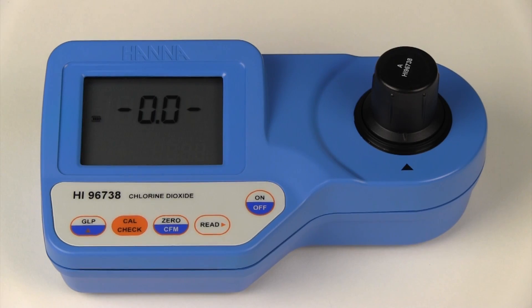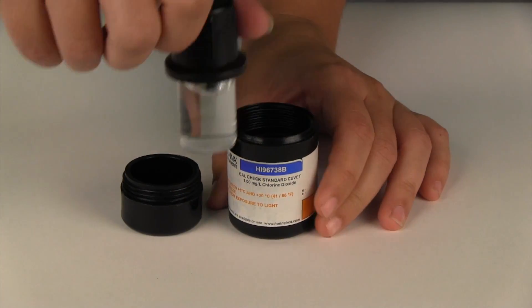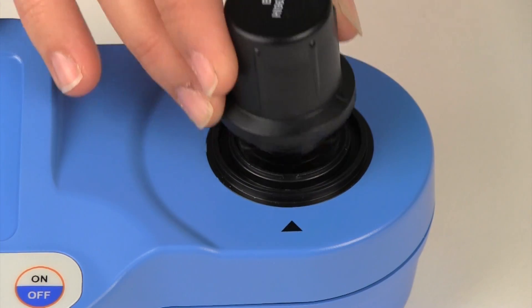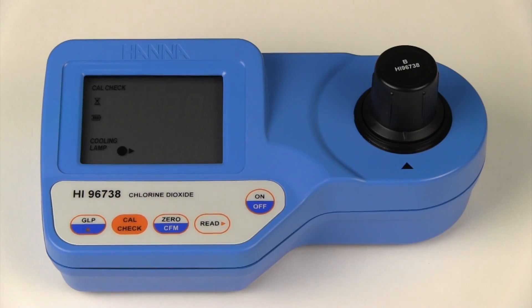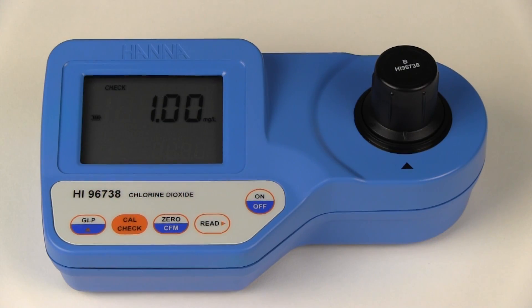Next we will perform the cal check on the 25 degrees Celsius standards. Remove the HI-96738B one milligram per liter cuvette from its container and wipe it of any dust or prints. Place the cuvette into the meter and index it. Press the cal check button to read the one milligram per liter standard. It is important to press the cal check button and not the read button when using the cal check standards. We obtained a reading of one milligram per liter.